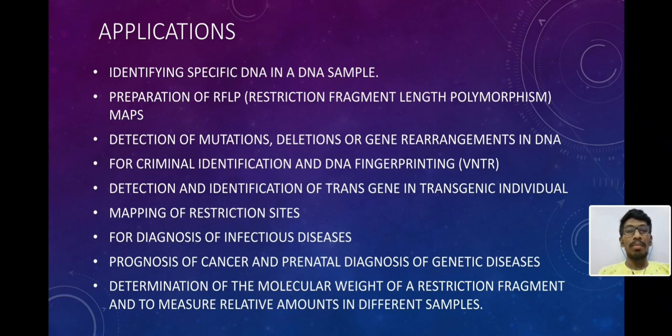We also include prognosis of cancer and prenatal diagnosis of genetic diseases, and last but not the least, determination of the molecular weight of restriction fragments and measuring relative amounts in different samples. These are the applications for which we use the Southern blotting technique.